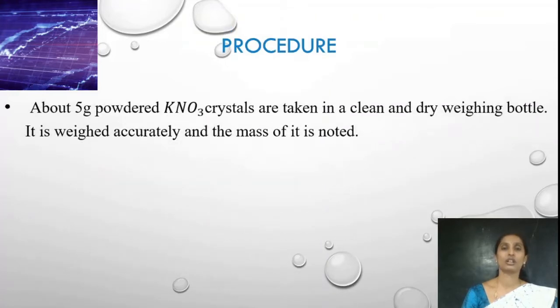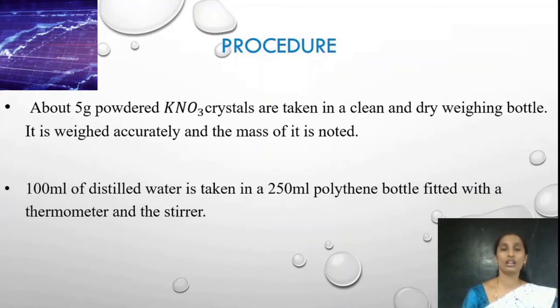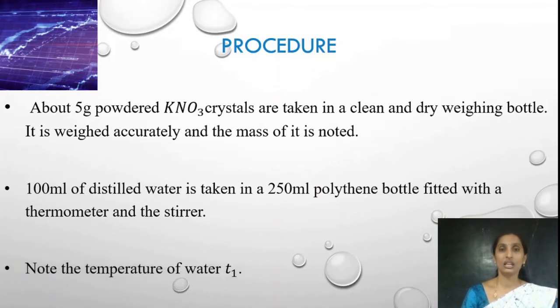Coming to the procedure. First, we need to take about 5 grams of powdered potassium nitrate crystals in a clean and dry weighing bottle. It is weighed accurately and the exact mass is noted. Once the exact mass is noted, fill 100 ml of water in a 250 ml polythene bottle fitted with a rubber cork and a stirrer. Once fitted, note down the temperature of the water and record it — let that be T1.